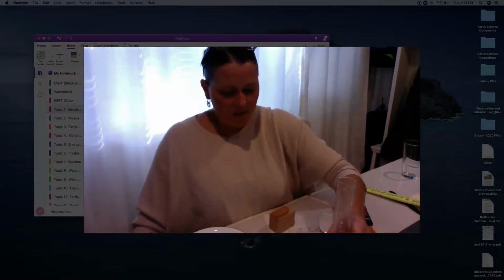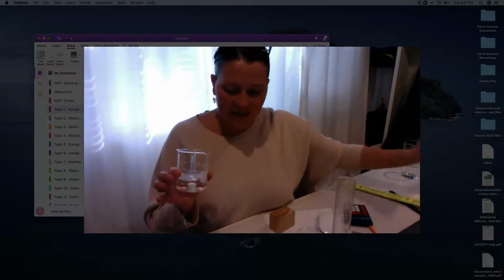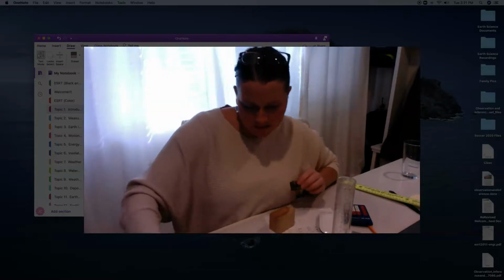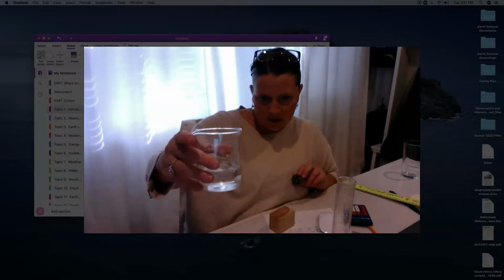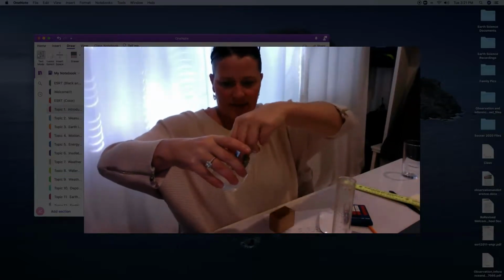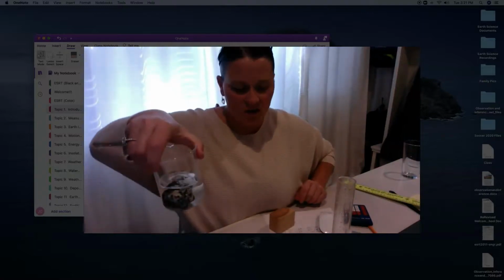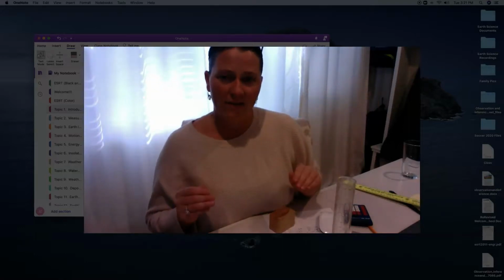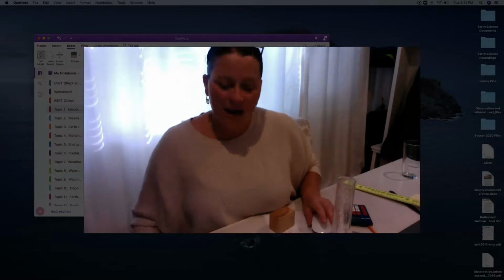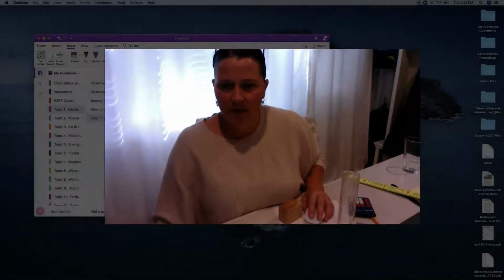So that leads me to get one more volume using the water displacement method, of my piece of granite. All I need to do is find my starting number for my beaker of water here, which is 100. I tilt it to the side, I place the rock in there, put it back down flat, and it reads 125, which means that when I placed the rock in there, it went from 100 to 125. We have a water displacement of 25, so 25 ml.